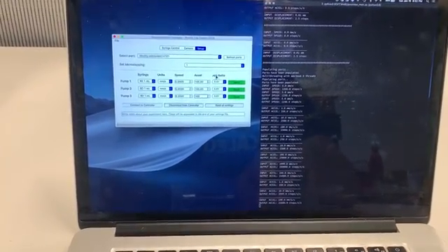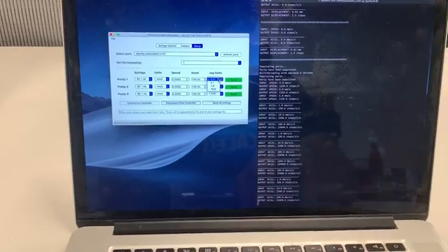If you look at the Jog Delta column, you'll see a bunch of different options. This tells you how much the carriage will move when you press the jog button — a value of one would mean it moves one millimeter. I can also change the units; for example, if I select milliliters per second, my flow rate becomes five milliliters per second and my jog delta becomes one milliliter. I can also change the syringe type depending on what I'm using, and the units will update accordingly. Once that's done, I'll click Send All Settings to send everything to my Arduino.